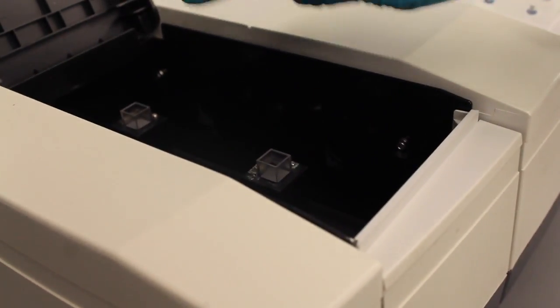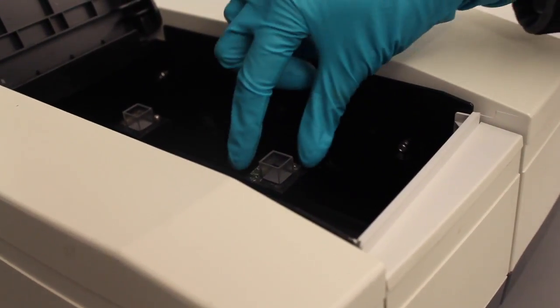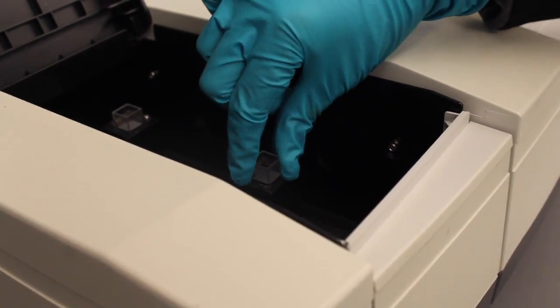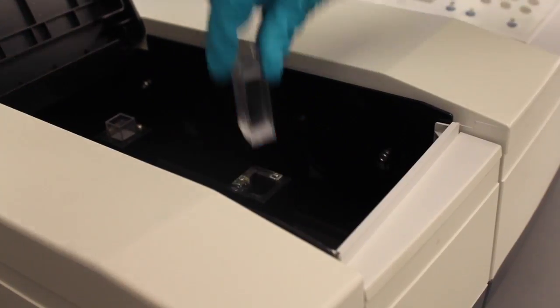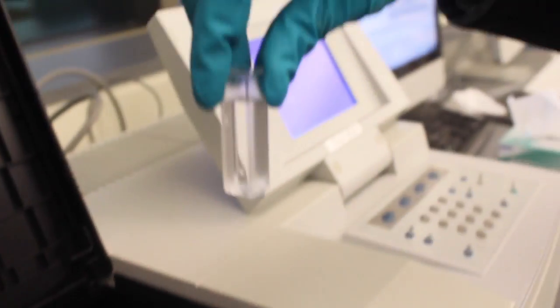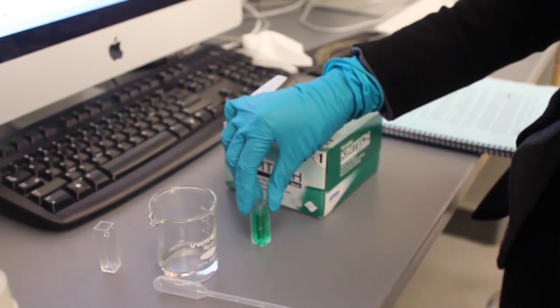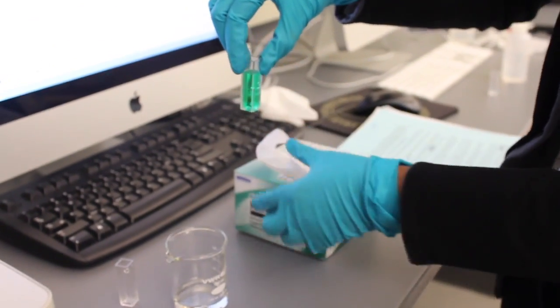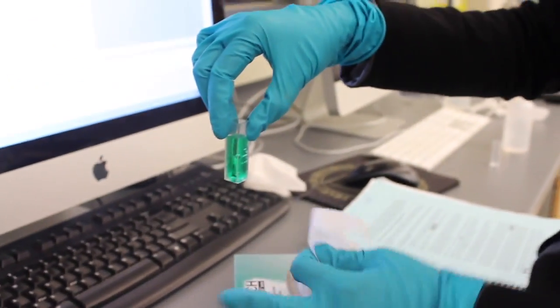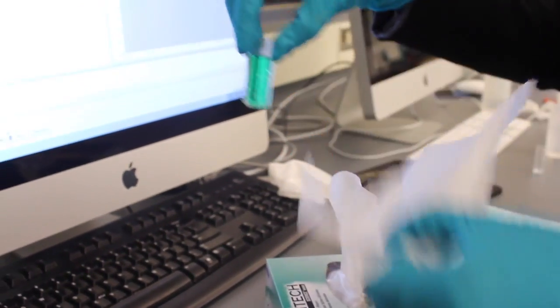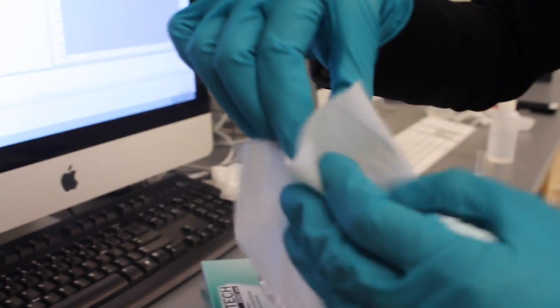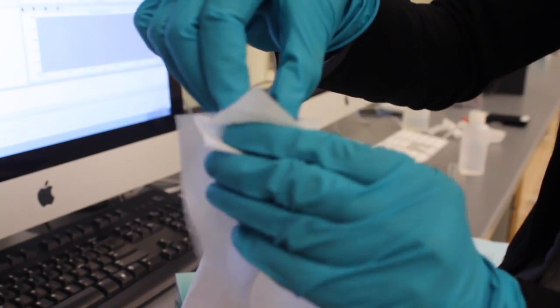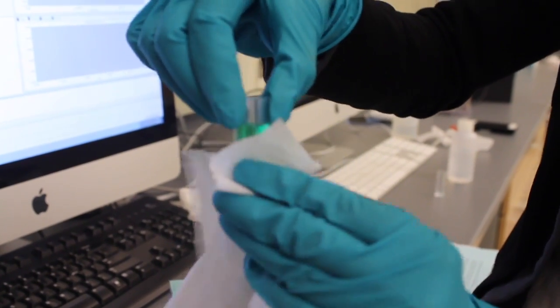You can then remove the baseline cuvette that is in the sample slot, which is the one closest to you. Replace it with your sample cuvette, once again making sure the clear sides are on the left and right hand side.